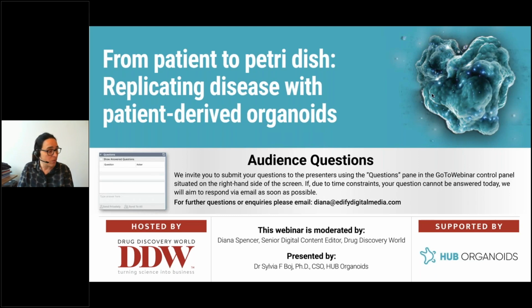No, so we have seen a different level of efficiency in establishment of organoids. If you exclude, again, the quality of the sample that you receive, because if the tissue is very necrotic, or the tumor content is very minimal, then you will not establish the organoids. And I think this has nothing to do with the organoid technology, but with the quality of the material you receive to establish such models.